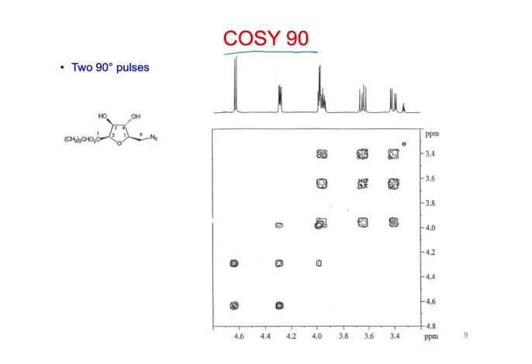This spectrum here does not include these out here on this ester, but it does include all the peaks around, so from this 2, 3, 4, 5, 6.